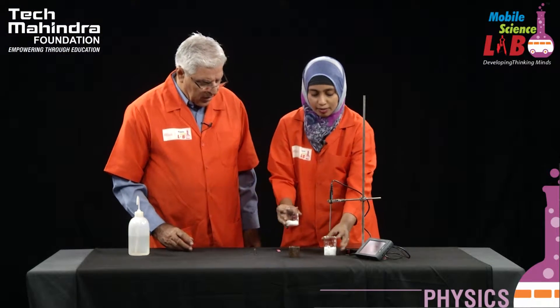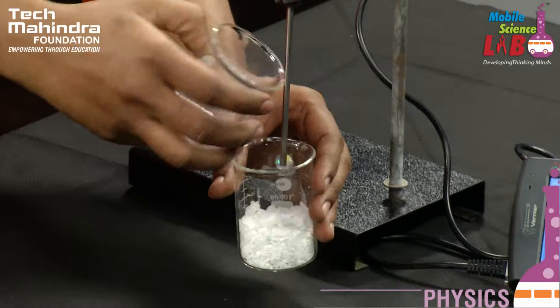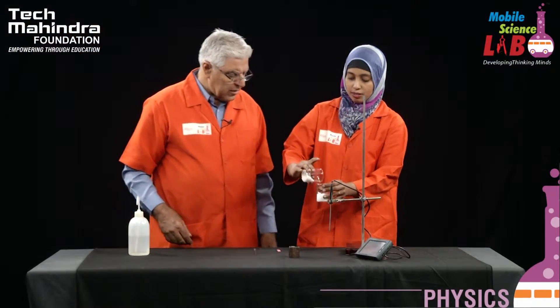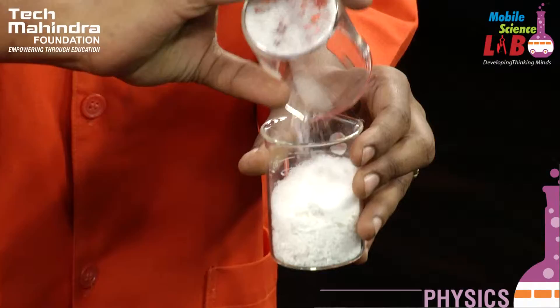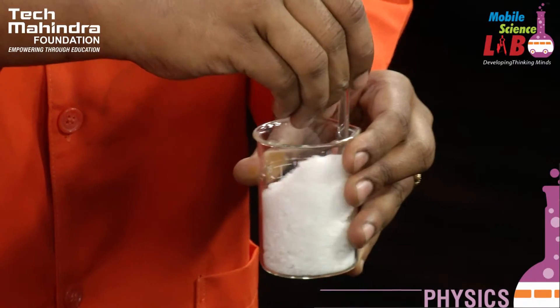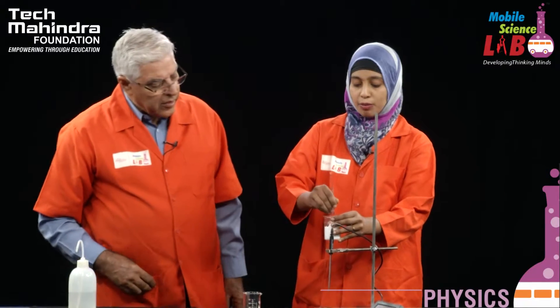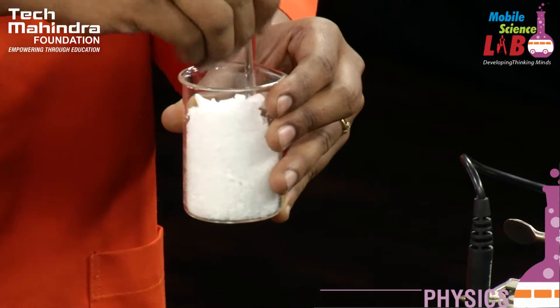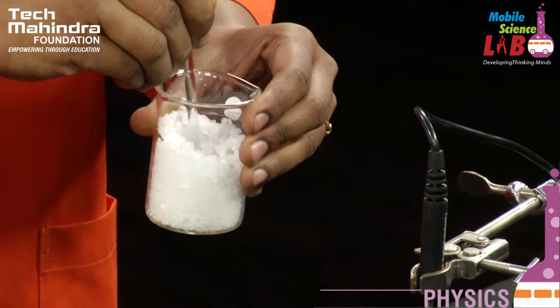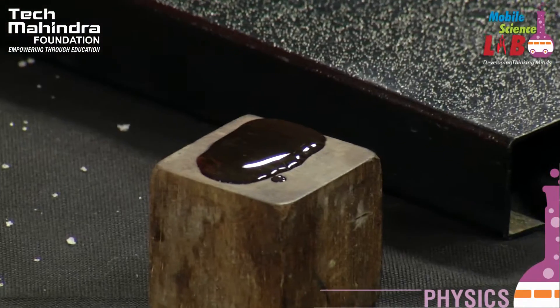So I'm going to take ammonium thiocyanate into this barium hydroxide. You can take it a little outside first. Now you add. Mix it up nicely.